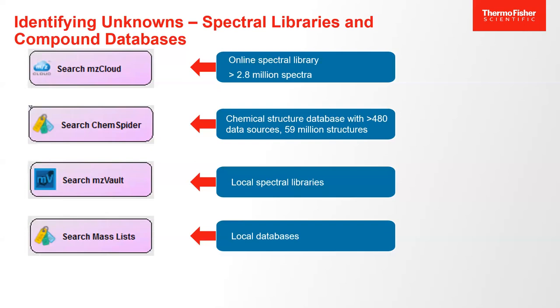The cool part is, no matter what mass spec you're on, we collected these spectra under every condition. Let's say, "Craig, well, they're all Orbi spectra." Correct. But they're Orbi spectra from zero collision energy to 200 electron volts. So let's say I have a QTOF. "Oh, I understand, Craig, I made a mistake. I bought that QTOF downstairs. I want to put it to good use."